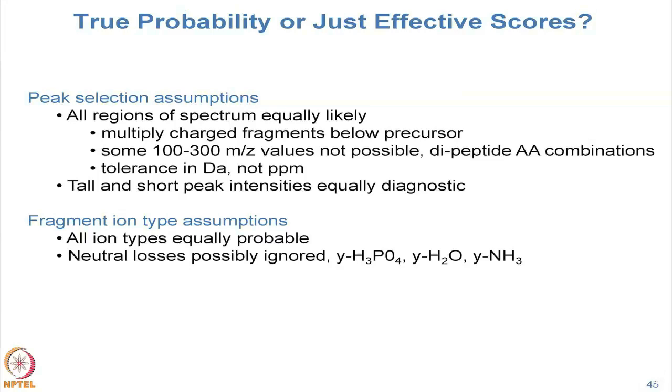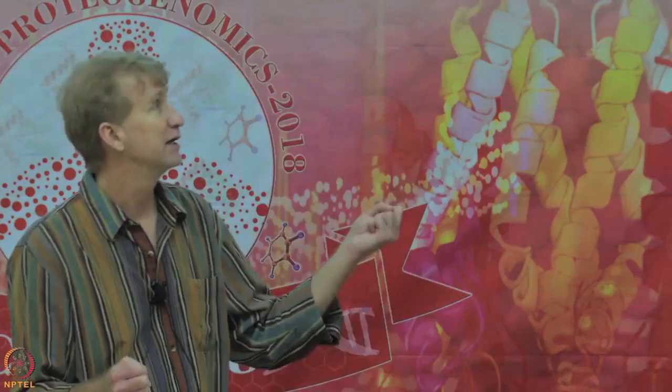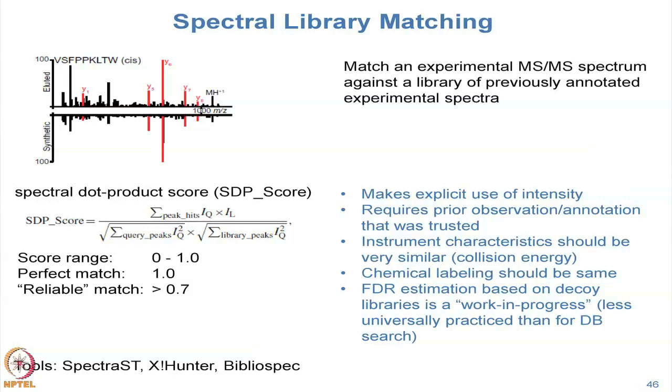Now what I want to show you here is a contrast. This is what you would do if you knew what that peptide fragmentation was going to look like, okay? And you would know what the spectrum is going to look like because you already had a spectrum that you trust and is used as the reference, presumably because you knew you had the peptide, maybe you made it synthetically, generated a spectrum, that spectrum becomes put in a library, and then all the experimental spectra you generate, you just match to the library. Okay, the particular case that I'm showing actually is one of these things where somebody is trying to demonstrate that the thing that they observed in a complicated experiment, they made the synthetic peptide, the spectrum looks almost the same, you can calculate a spectral similarity metric, and it passes the threshold, and they can say, see, this is what we said it was.